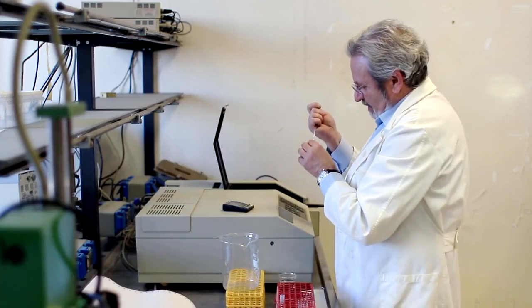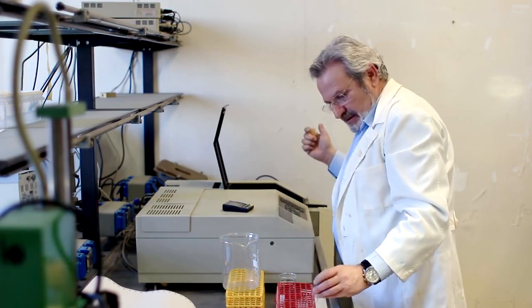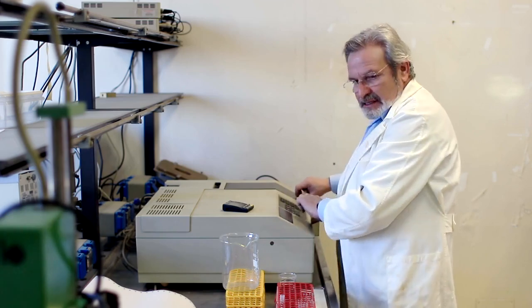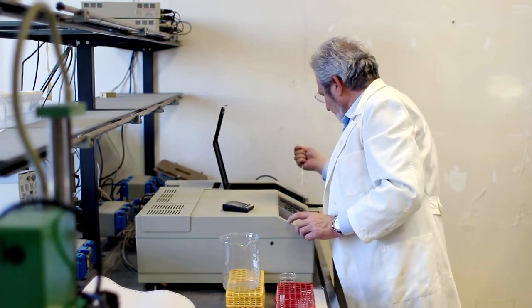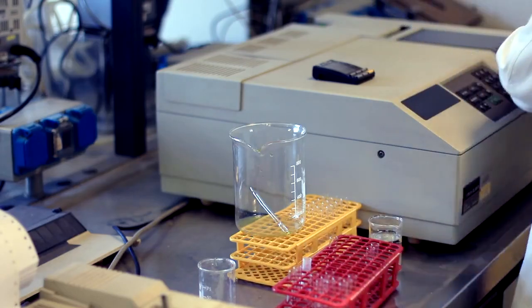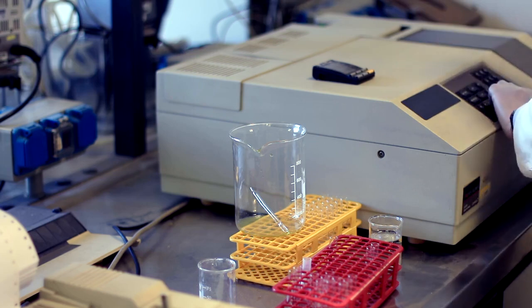Measuring cylinder. A calibrated cylindrical glassware or plastic used for measuring the volume of liquids. Spectrophotometer. An instrument used to measure the intensity of light at different wavelengths, often used in chemical analysis or biochemistry to determine the concentration of substances.